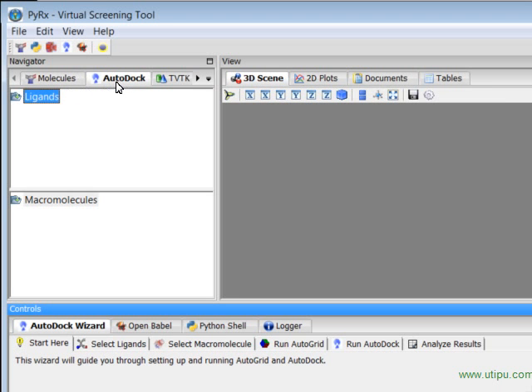Pyrex has this AutoDock tab under Navigator panel that is used to store ligands and macromolecules. During the screencast I'll show you how to prepare a ligand then use AutoDock wizard to run the docking.